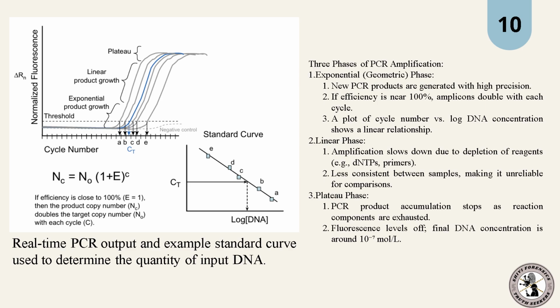Matlab, they are being used up, so they are depleting, and the amount of PCR product being produced is changing. It's not consistent in this step. So that's why this step is not reliable enough for us to produce the results for DNA concentration.